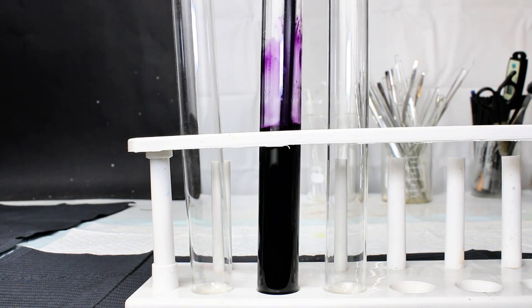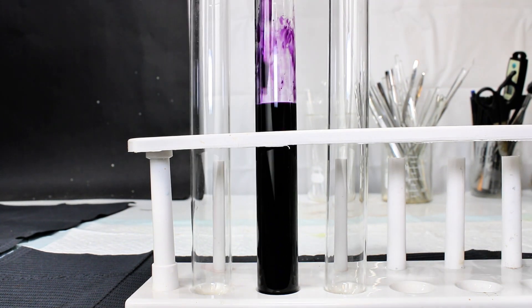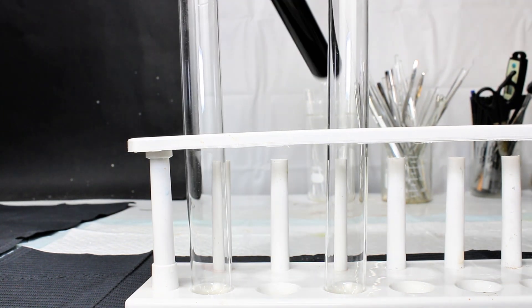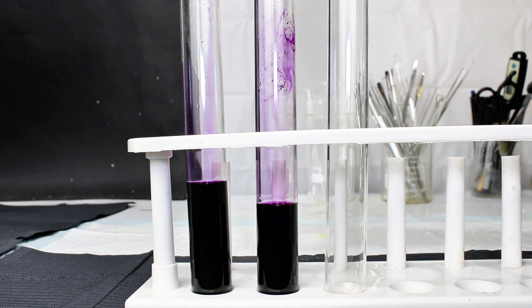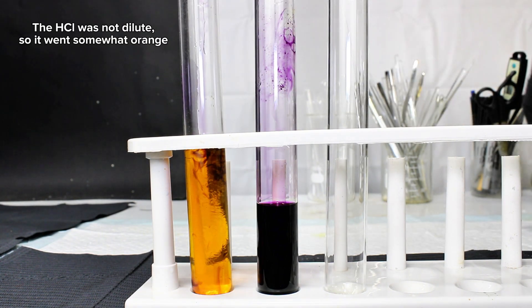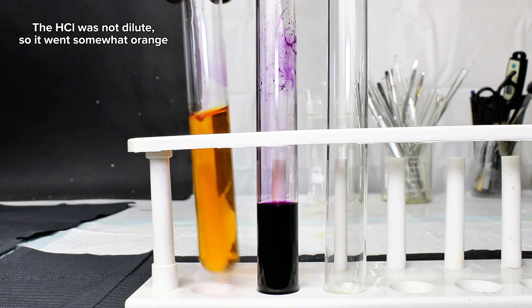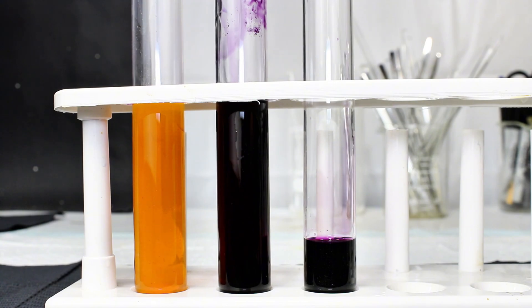This Azo Violet solution will turn light yellow when acidified with dilute hydrochloric acid. This property makes Azo Violet a decent pH indicator, as the transition from violet to yellow happens around pH 11. This is honestly quite alkaline as far as indicators go, and the only other pH indicator I can think of that makes a transition at such alkaline conditions is indigo carmine.